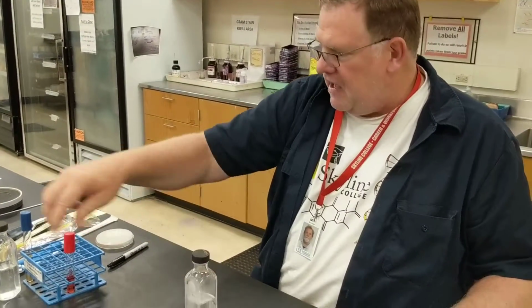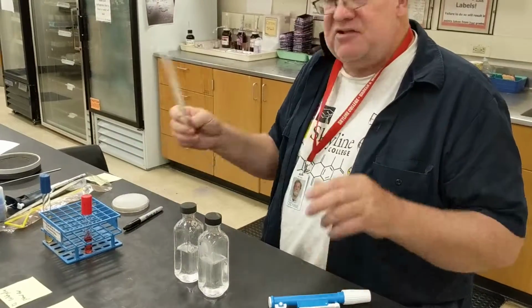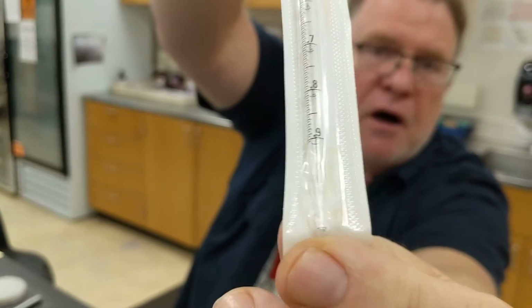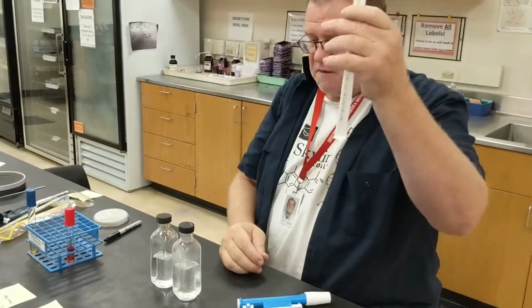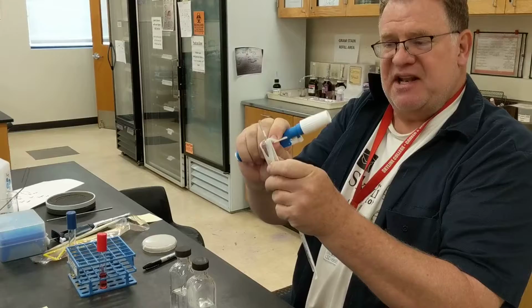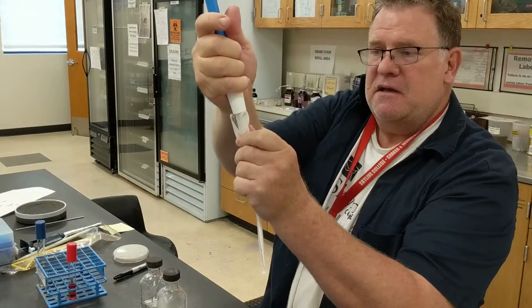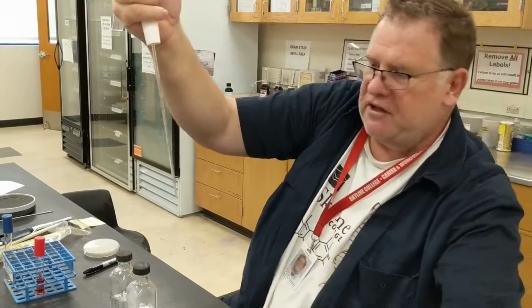So you would have your dilutions here. We are going to use a serological pipette, and with a serological pipette, the whole volume goes down to the very tip, so you don't leave any in the pipette. This pipette is sterile, so you're going to be opening up the pipette from the opposite end. Try not to touch the pipette. You will use a pipette aid to put your pipette in here. This goes in the garbage, wherever the garbage is.